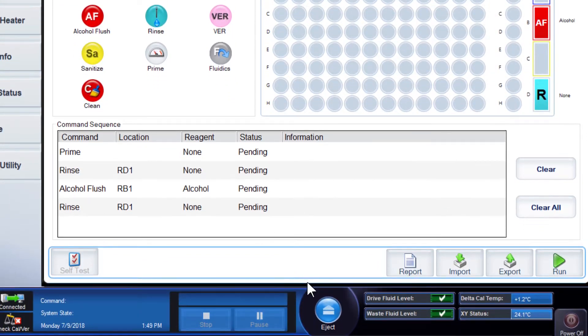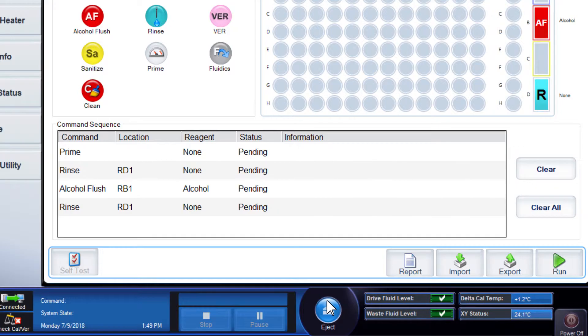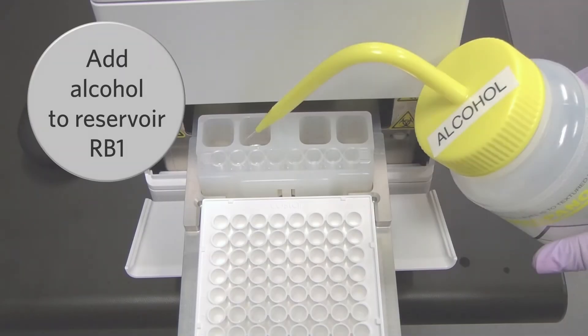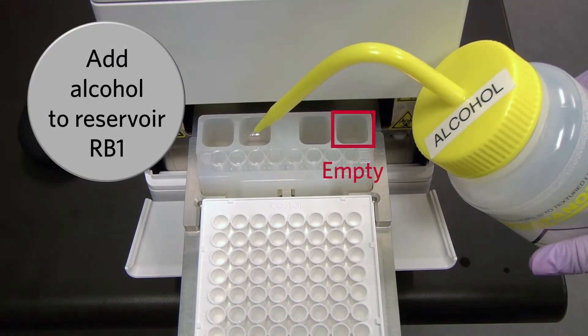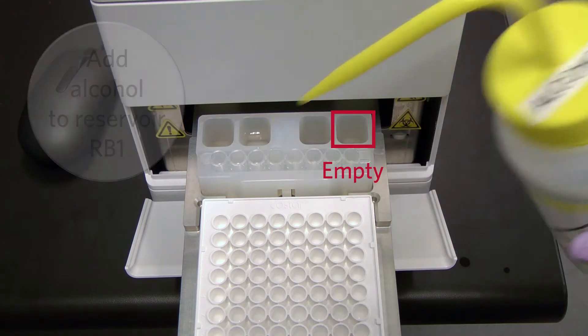Click Eject to access the off-plate reagent block. Note, the Rinse Reservoir should be empty.